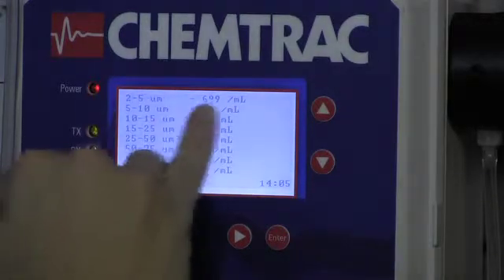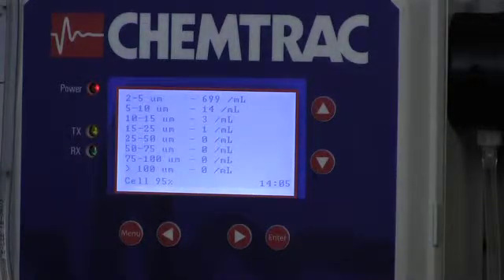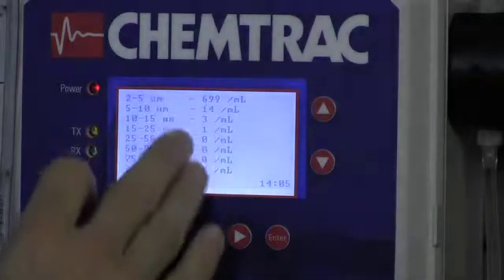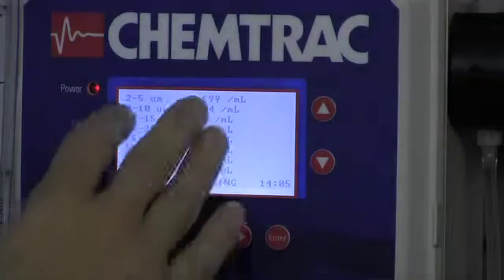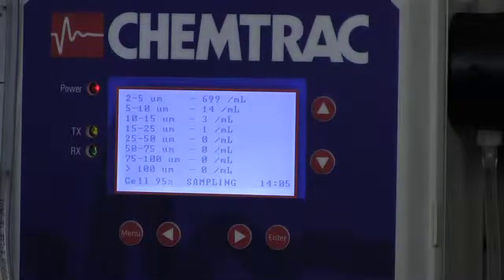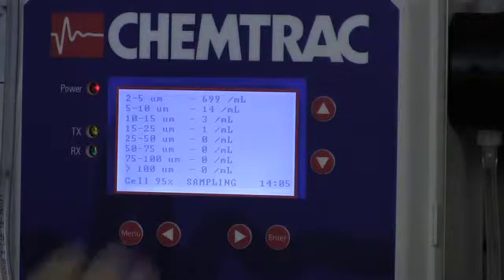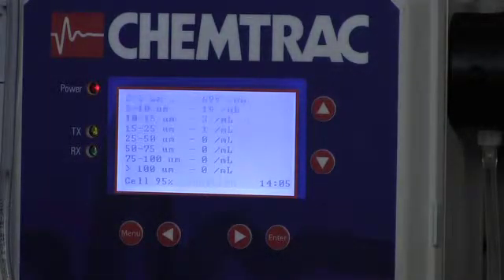So what we ideally would see here is 1,000 counts per milliliter, and what we have of course right now is 700 counts. We knew our background counts were around 50, so we really have about 640, 650 counts per milliliter that are showing up right now. So we're a little bit low on our count accuracy.